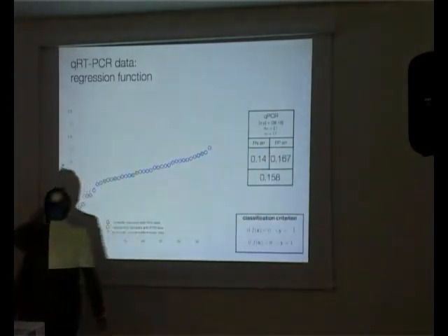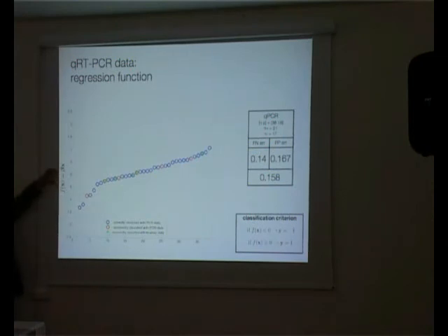You remember, we computed the beta coefficients. Now the x vector is a bunch of real-time PCR figures. We add them up, weighting them with the beta values, and we get the function f of x. And now we never do something particularly intelligent, so we simply check whether it's positive or negative, right? If it's positive, it's type 1. If it's negative, it's type 2.